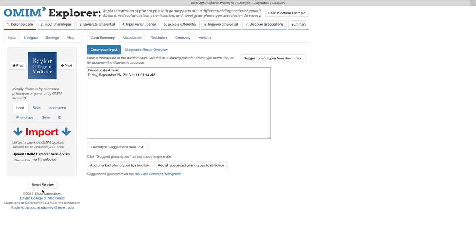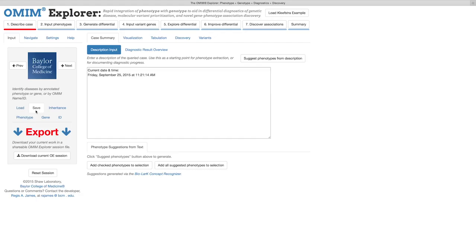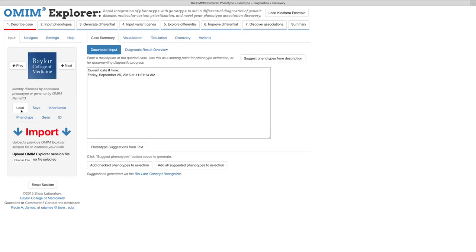You can always save and later reload a case to continue analysis where you left off. However, in this example, we will create a completely new workflow and identify a causal variant.